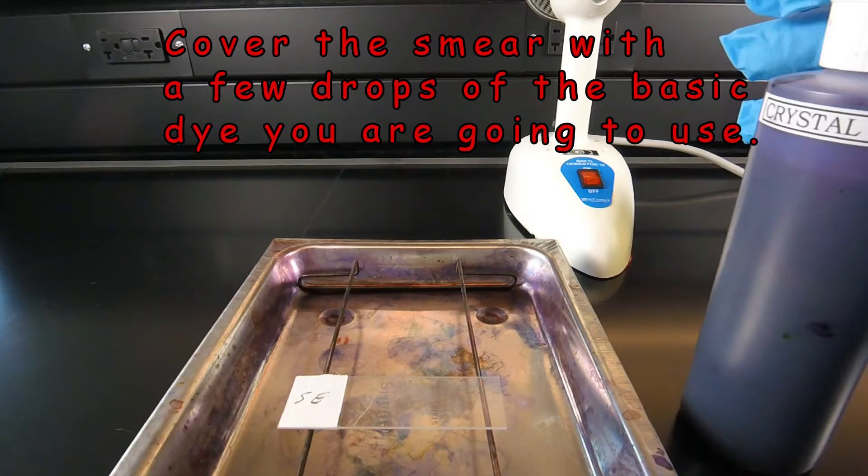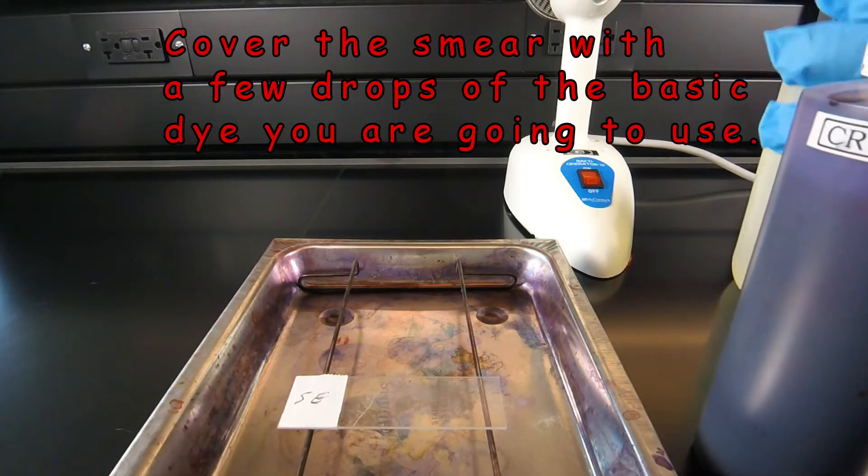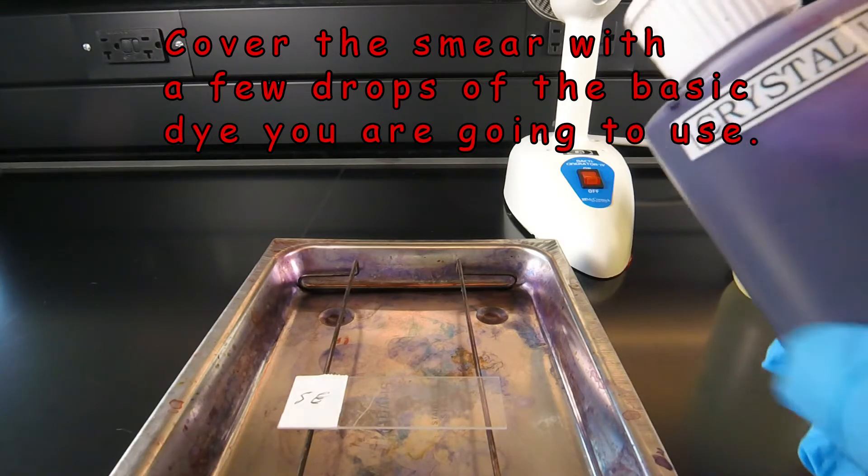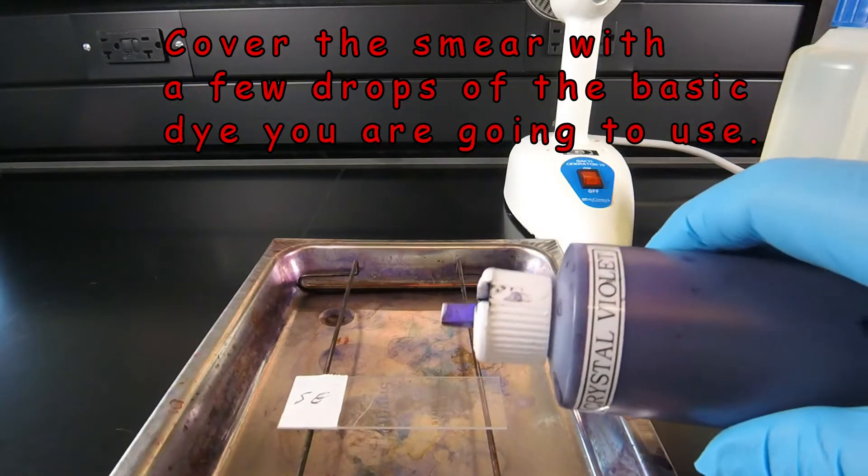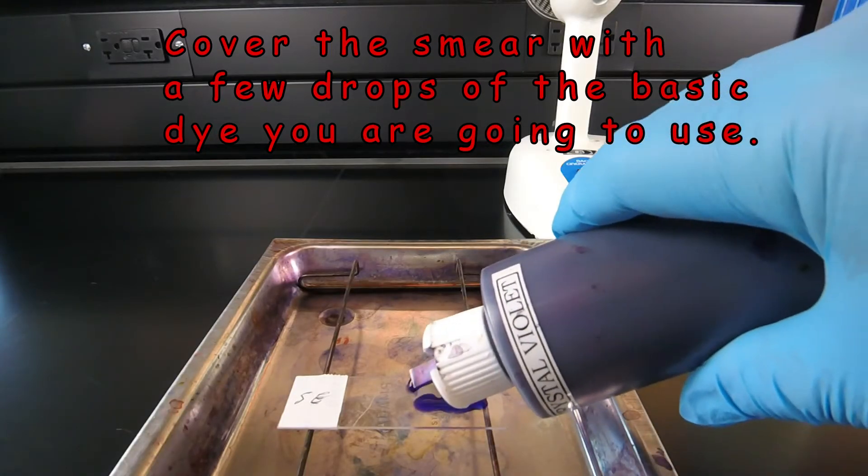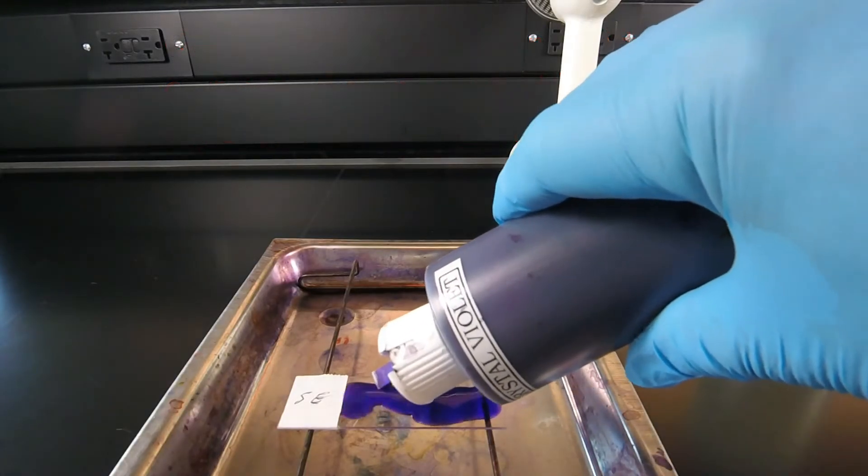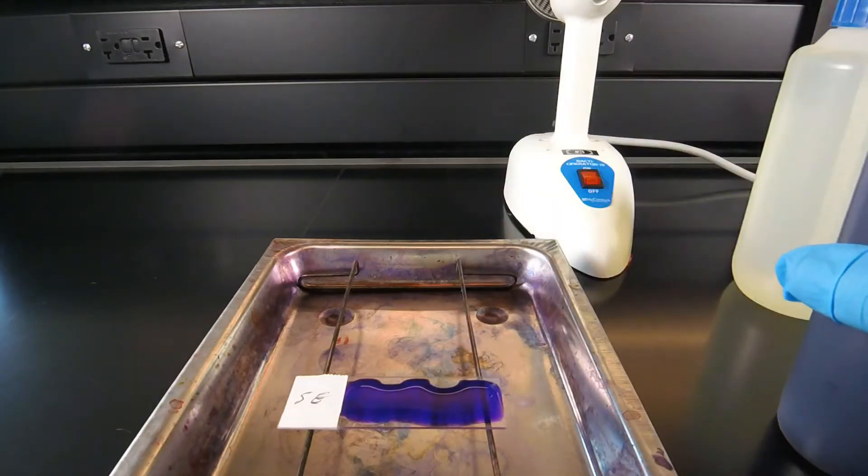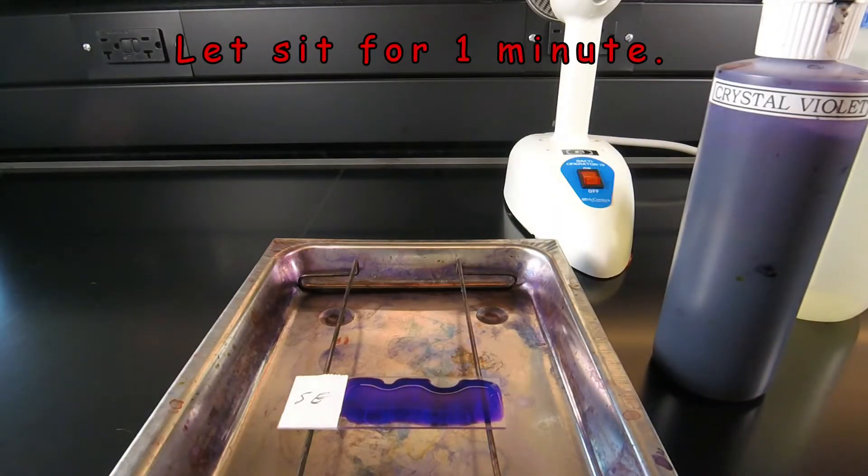We're going to take some crystal violet, a basic dye that gives us a direct stain, and add enough dye to cover a good portion of the smear. Now we're going to leave the crystal violet on for one minute.